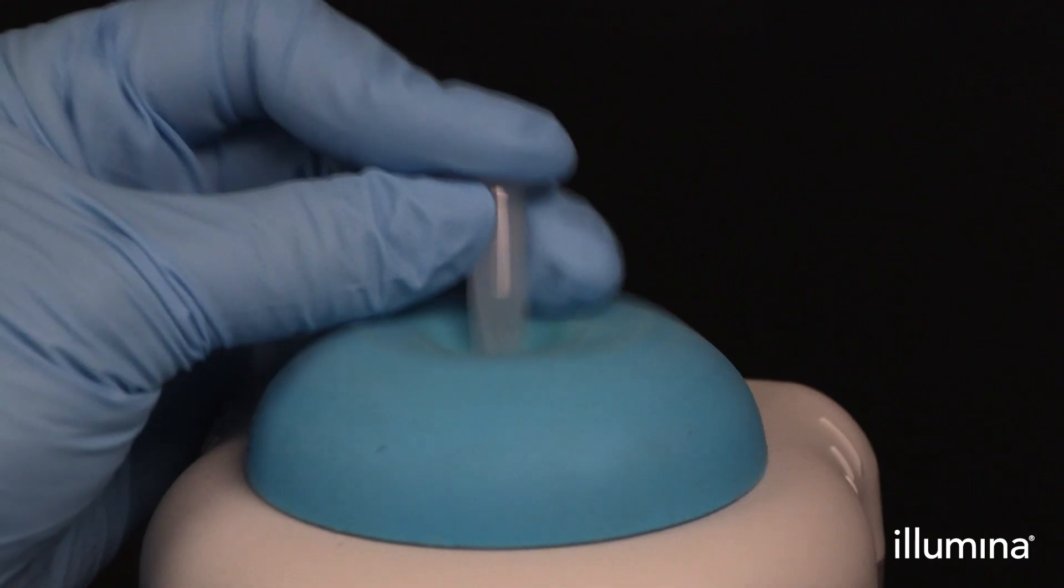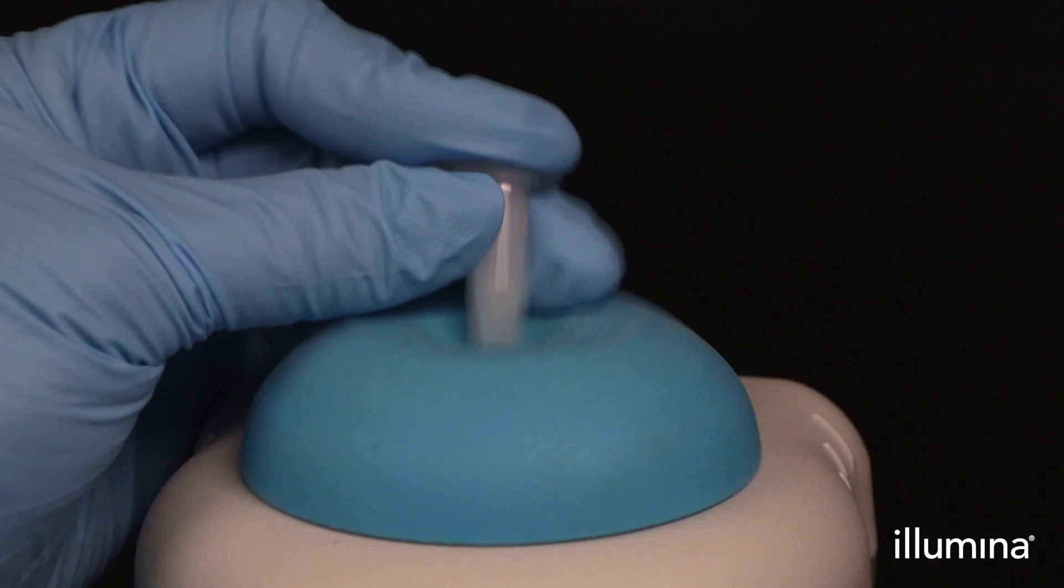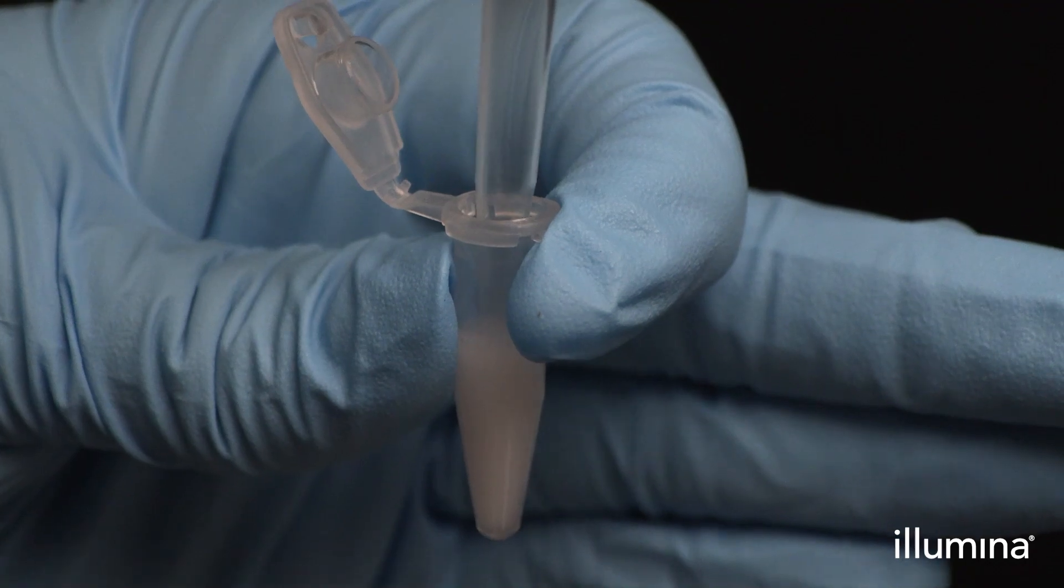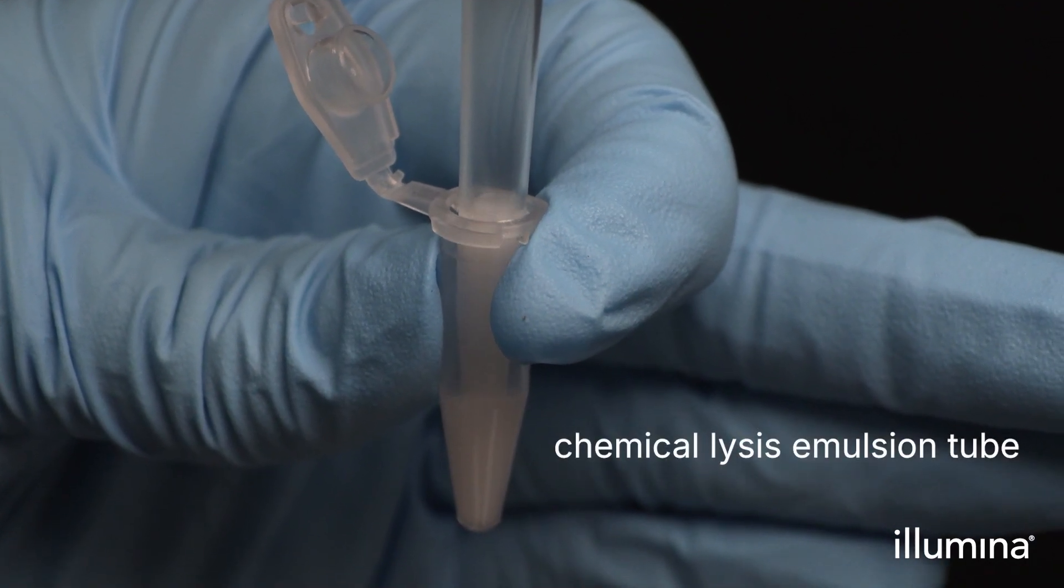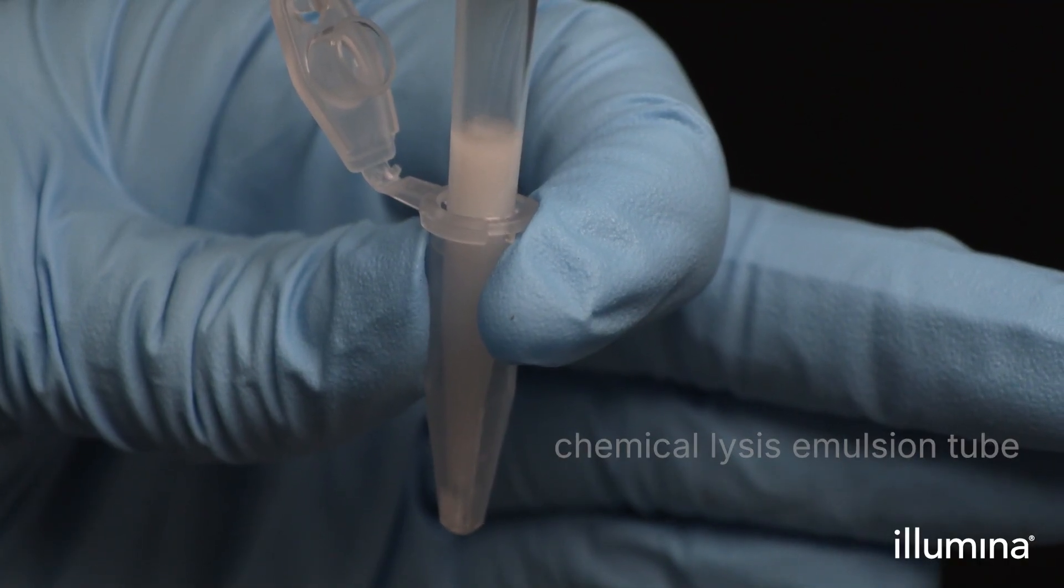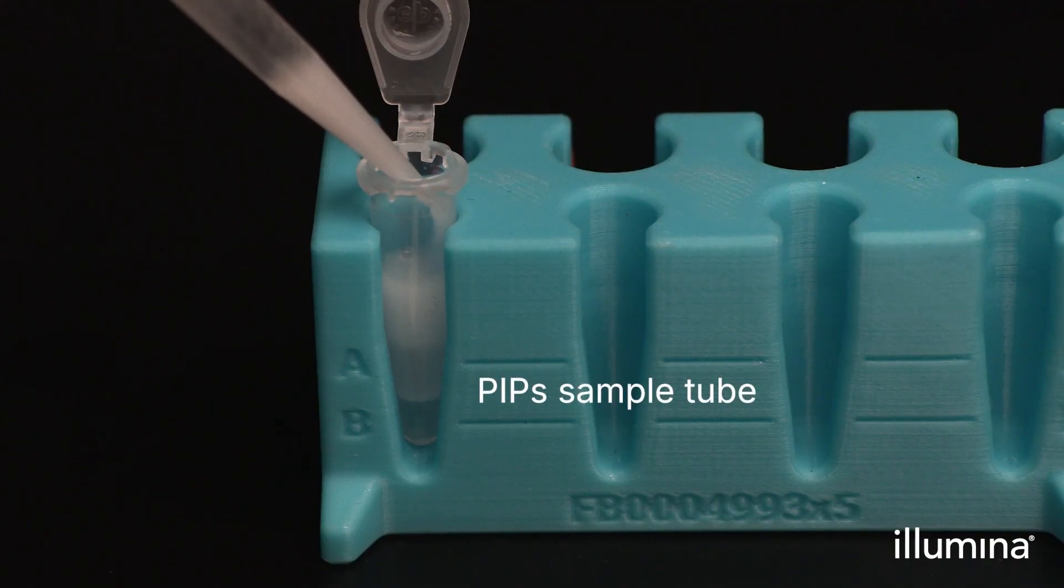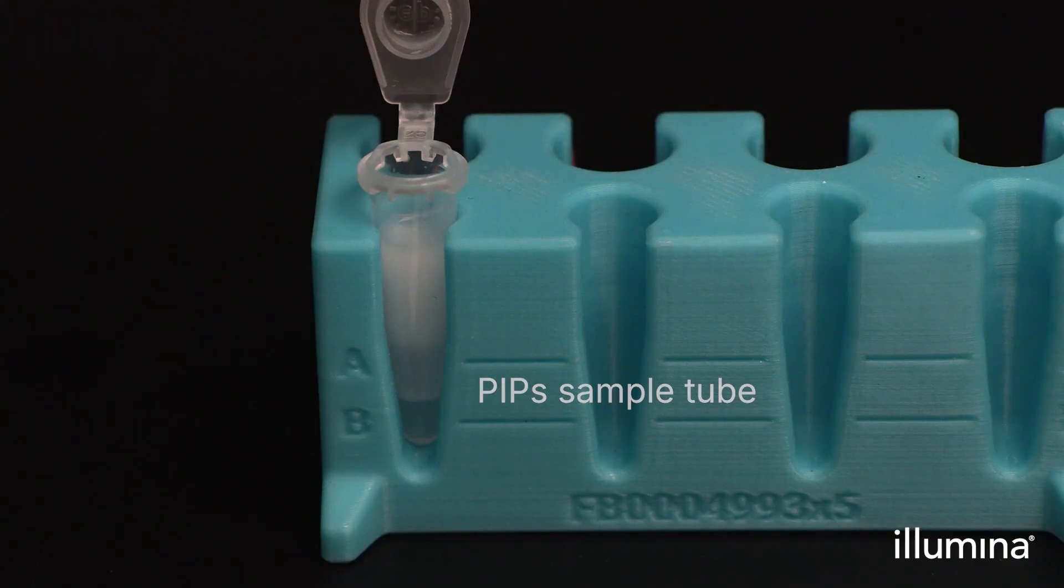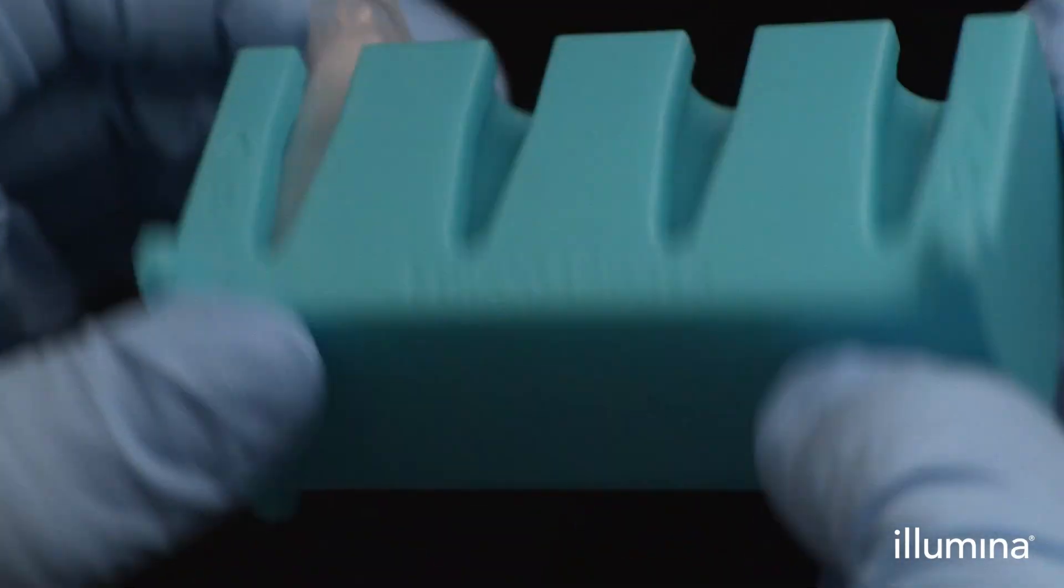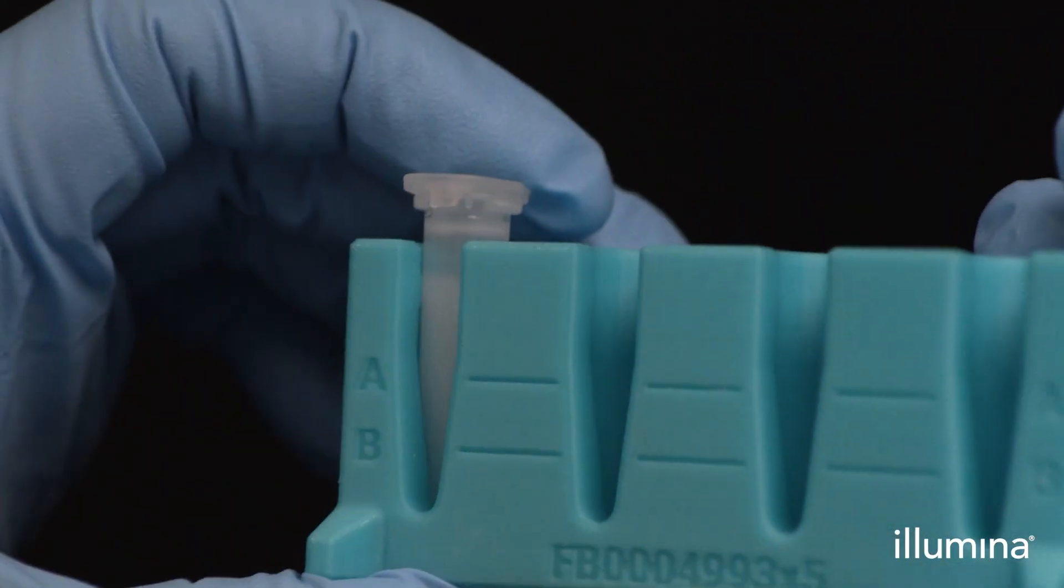Next, vortex the tube for 10 seconds at max speed on a standard benchtop vortexer to generate the chemical lysis emulsion. Immediately transfer the entire chemical lysis emulsion into the pip tube before closing the tube and inverting 10 times. Then proceed with the next sample by adding partitioning reagent and repeating these same steps.